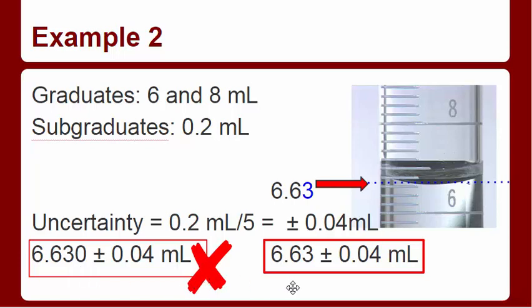So you can have any number here. The one that you estimate is the closest to, it's more accurate. But for example, if you have 0.04 for your uncertainty, that doesn't mean that you have to count by fours. You can have a 3 or a 5 or something else. Right.